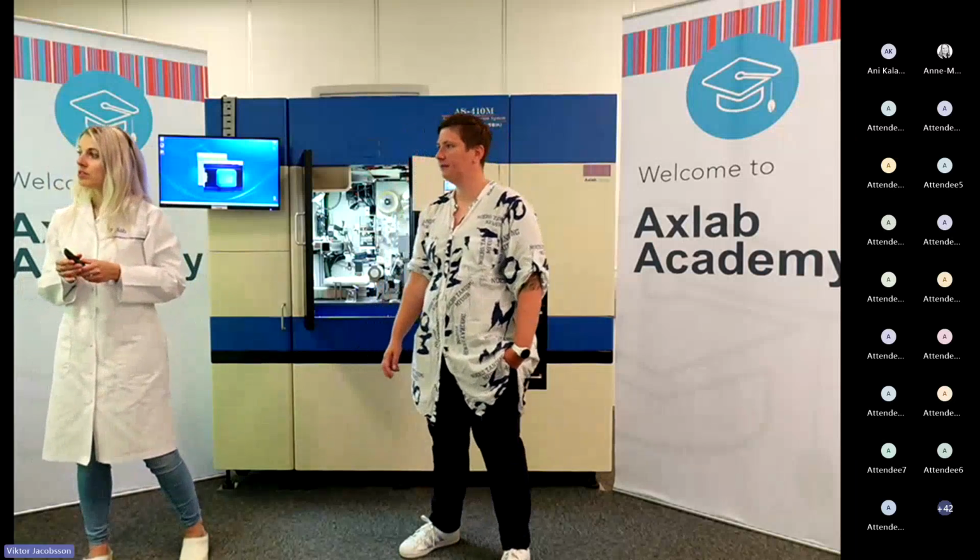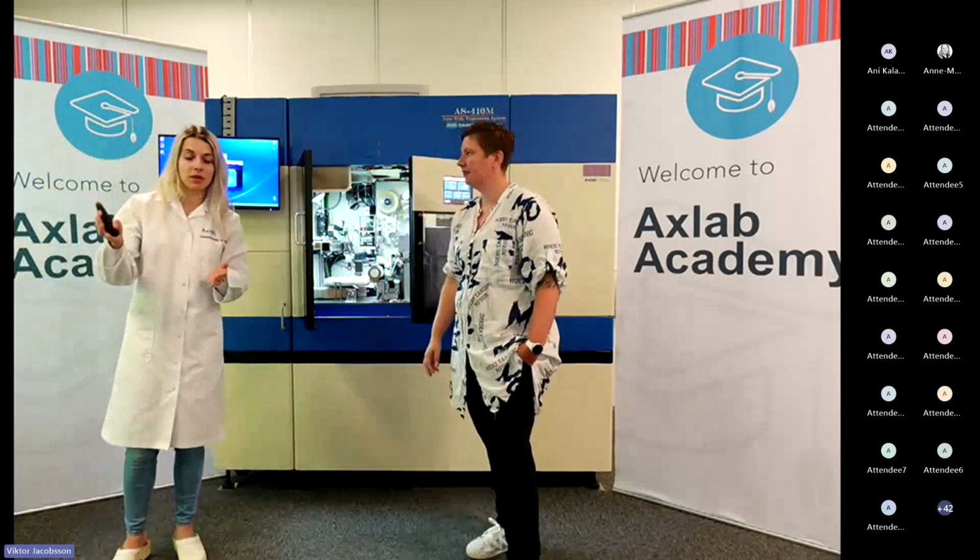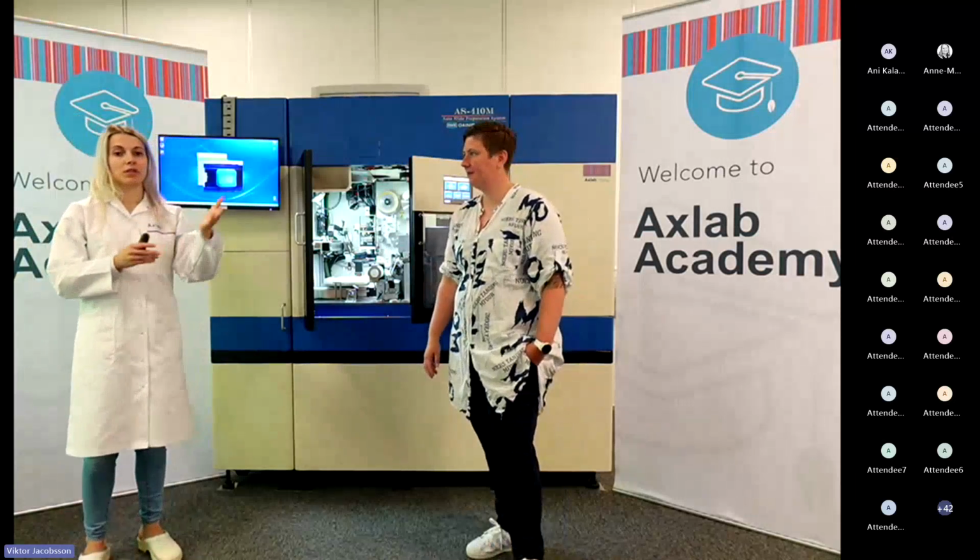Yeah. Next question. What's the lowest and highest setting for tissue thickness? So the lowest we go is 3 and the highest is 10. The lowest might seem high on 3, especially for Europe. I'm not sure how it is in the US. I hear 3 and 4 is actually the norm. But it is a converting table.